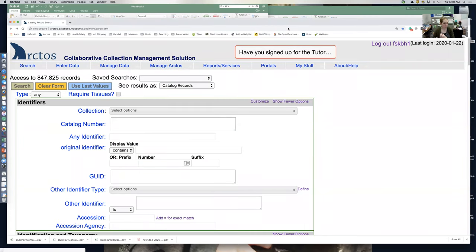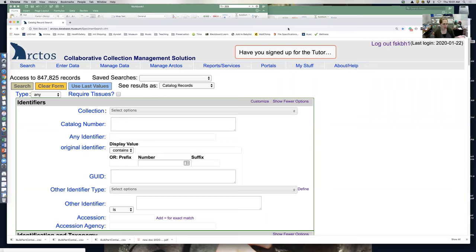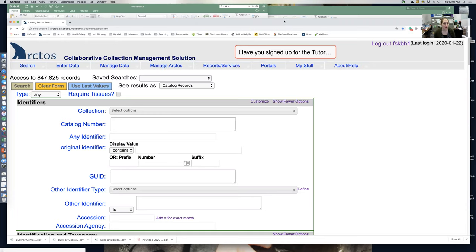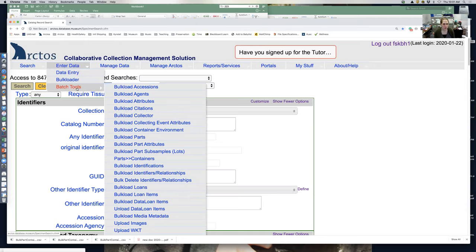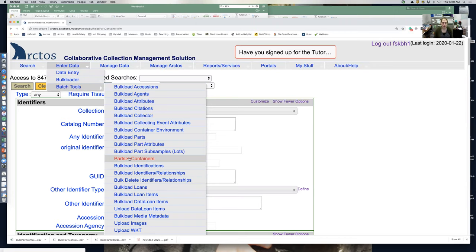In this tutorial, I'll show you how to upload bulk parts that don't have barcodes into a container. I have a jar full of wood frogs that I need to put into a container. To do that, go into batch tools, then to parts contain parts to container.